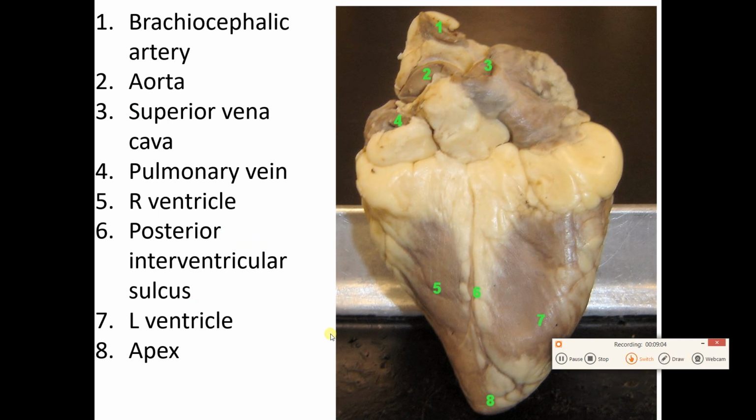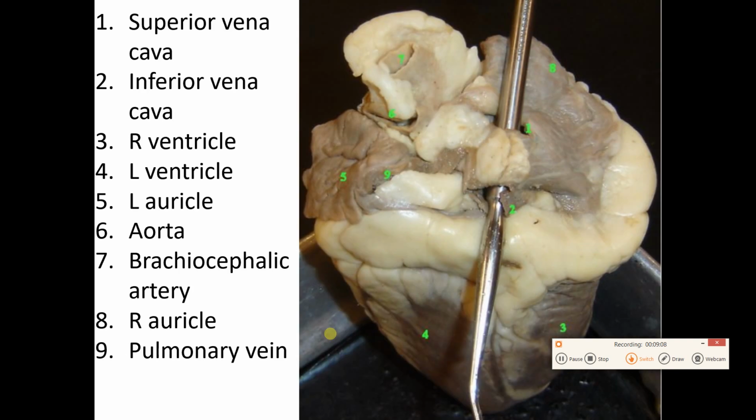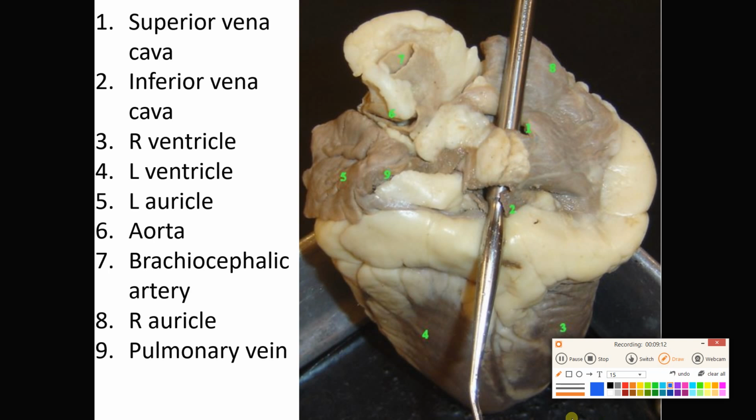I have no idea how many sheep heart pictures I'm going to be showing you right now. We're going to find out together. Oh, I like this one. It's a little weird of an angle, but I like it nonetheless. We are in the back. If you can see, there is that vertical sulcus right there.